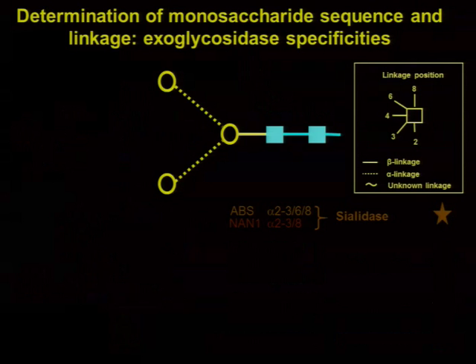All of these enzymes have what's called an incremental value. Each glycan contributes a certain amount of glucose unit value to your total glucose unit. So if you know that the incremental value of a galactose is 0.8, for example, then in your enzyme digest you're looking for a change of 0.8 glucose units, or if you have 2 galactoses, a change of 1.6 glucose units.